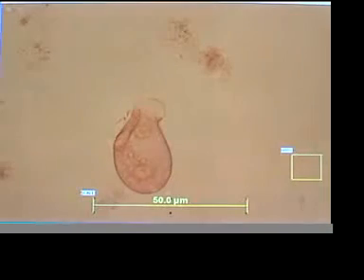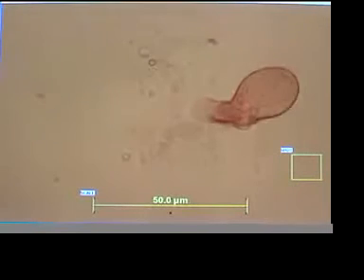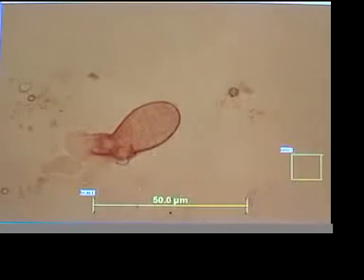No, he's not doing anything. I think he's done. He's not actively changing. Here's another one who is partially the way through the process. Oh, he's actually changing. Okay, let's watch him. Something's happening in real time with this guy. I need to check. Yep, the scale is correct. Yeah, watch him carefully in here. Some spheres are being ejected.